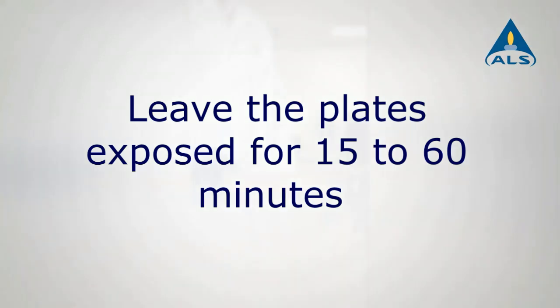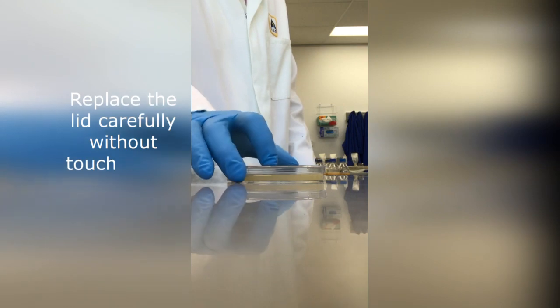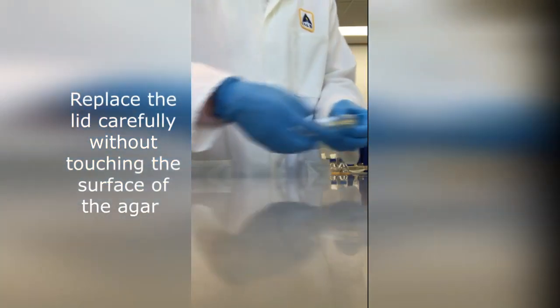After exposure, replace the lids of plates carefully without touching the surface of the agar. Remove from the production area.